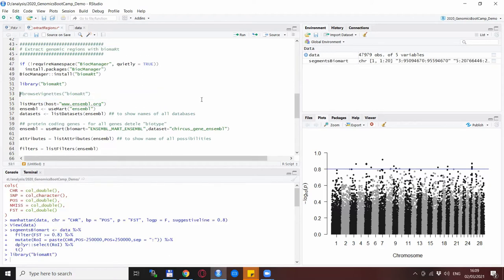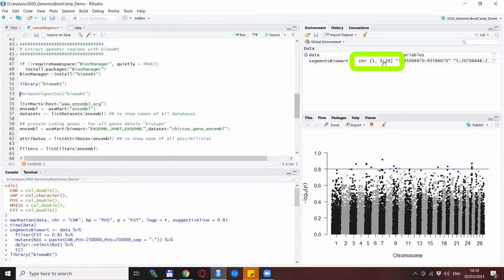In between I also ran the segments for Biomart part. It turns out that there are about 20 SNPs of interest which is shown here so we can continue to deal with these 20 regions or 20 SNPs of interest with the Biomart software.